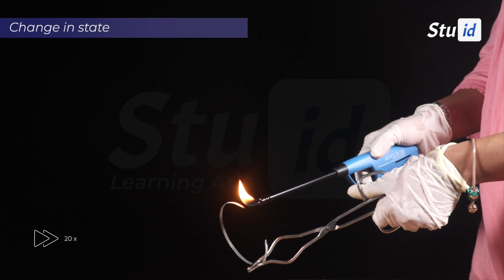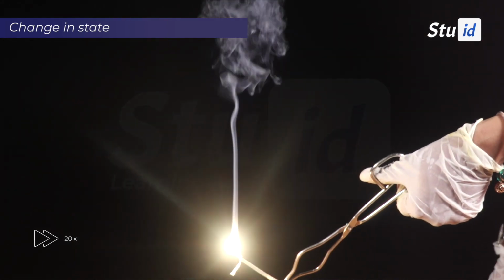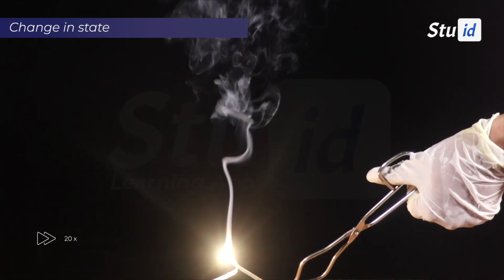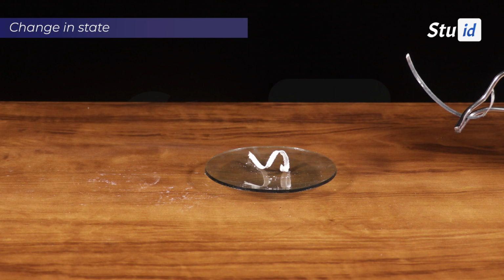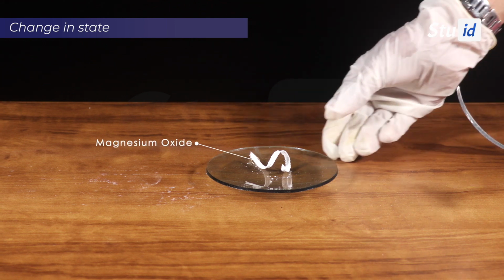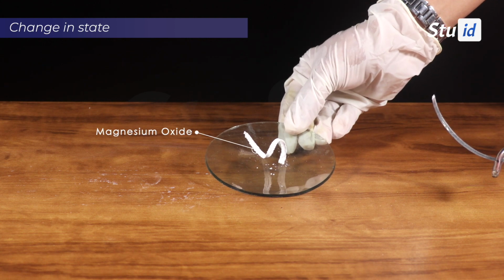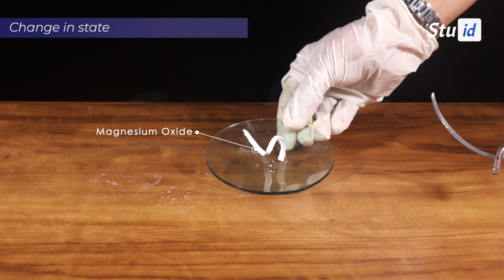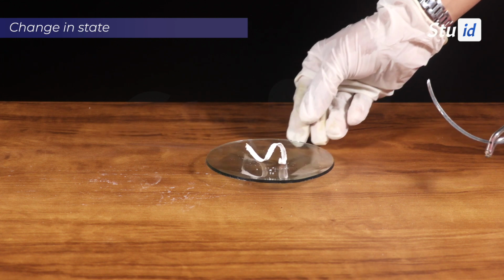So now, with the help of tongs, we are going to expose this magnesium ribbon to flame and keep the watch glass underneath it. You can see something is deposited there, which is white in color, and that white powder is magnesium oxide. You know why this magnesium oxide is formed? This magnesium combines with the atmospheric oxygen to form magnesium oxide, which is white in color.